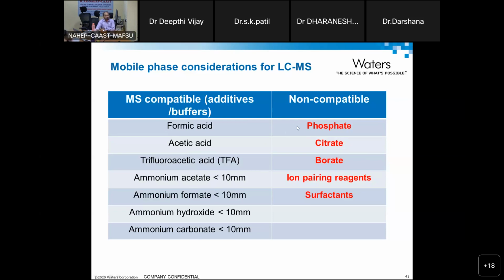The buffers which I have highlighted in red color, such as phosphate, citrate, borate, ion pairing reagents and surfactants, are not recommended for LCMS applications, since these are non-volatile.